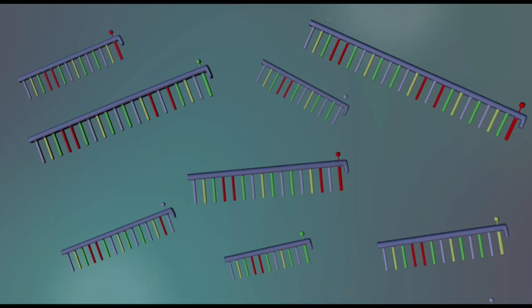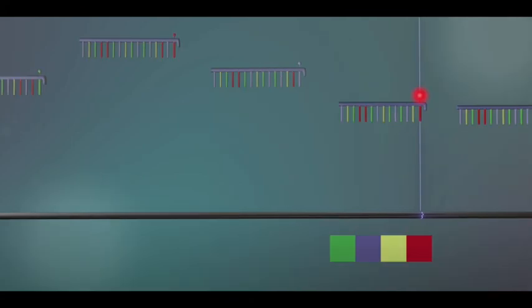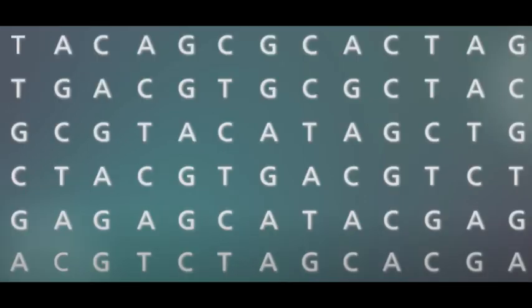These are then analyzed using gel electrophoresis, so the smaller fragments will travel farther through the gel, and then you can use fluorescence imagery to see which bases and which size of fragments. The color coding of the fluorescent tags is key here, so if you see a green fluorescent response, you know that corresponds to a particular base, A, T, G, or C. From this information of length combined with base, you can begin to build up the sequence of the sample. Thanks to the Human Genome Project for these graphics.